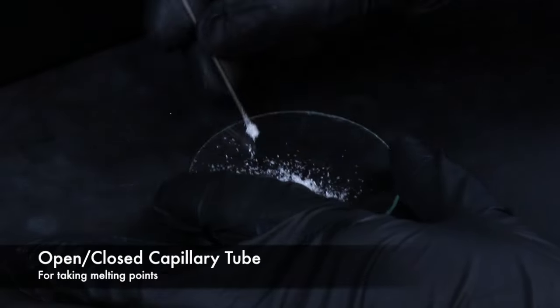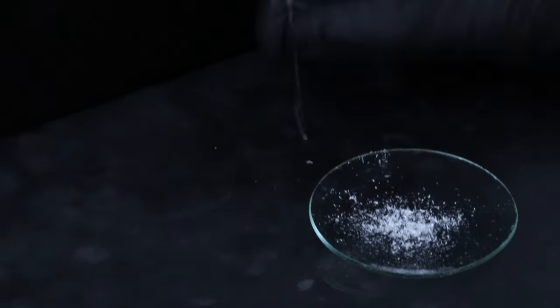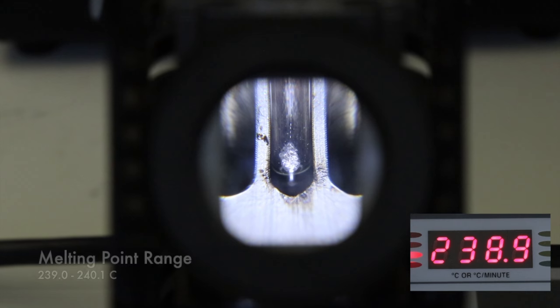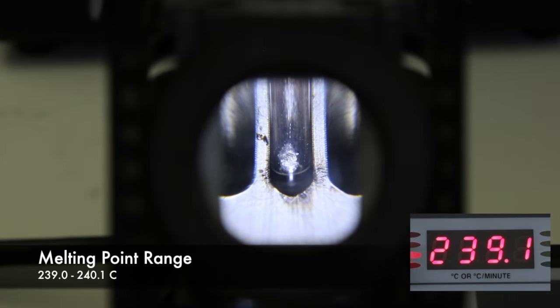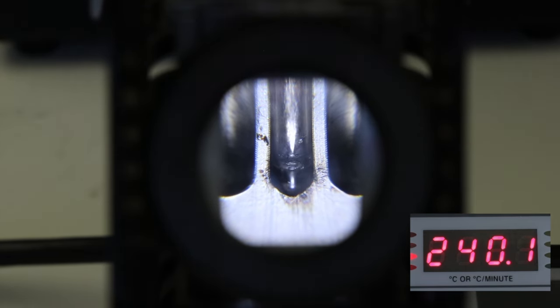Now I can characterize the product, so I'll put some in an open closed capillary tube to run a melting point. And we see the crystals start melting around 239 degrees Celsius and finish around 240.1. So it's a little lower than literature value, so there's probably some contamination.